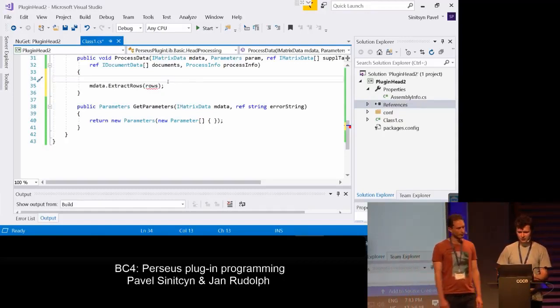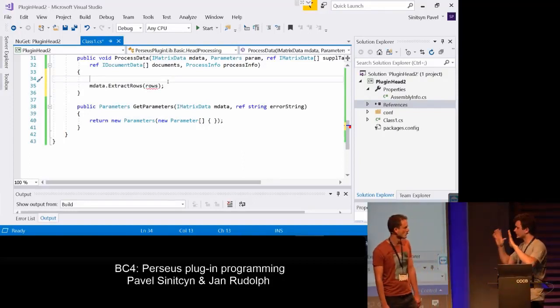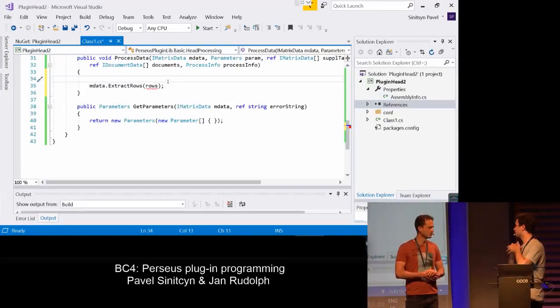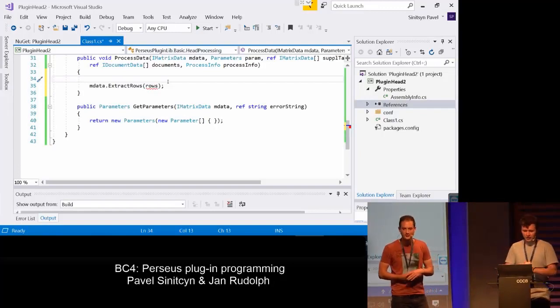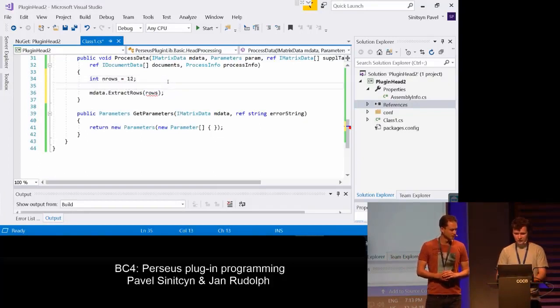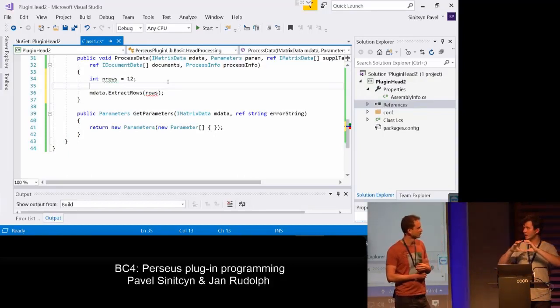Thanks. Okay, so we should create these rows. Which rows? For the first moment, let's select the first 15 rows. Yeah. Or, no, I don't like 15. 12? 12, okay. Let's select the first 12 rows. Let's say nRows, like 12. And now we should create the rows. That's basically going to be an array of integers 0, 1, 2, 3 until 11.